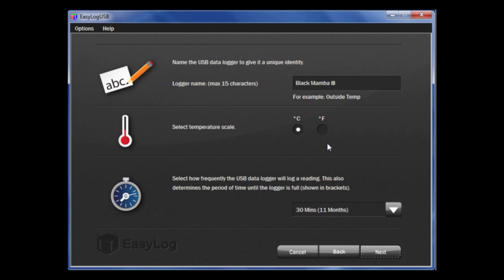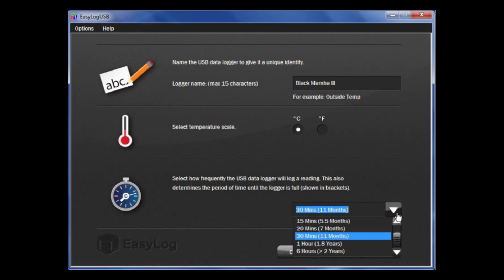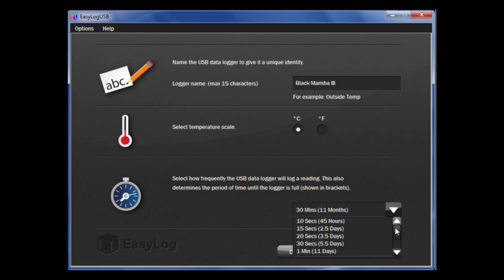Then, choose how often you want the logger to take a reading. You will note with these options in brackets, it shows how long it will take the data logger to fill up with data. Once that is complete, click Next.